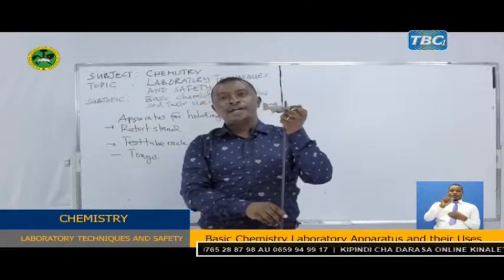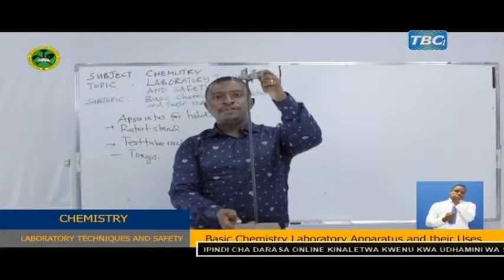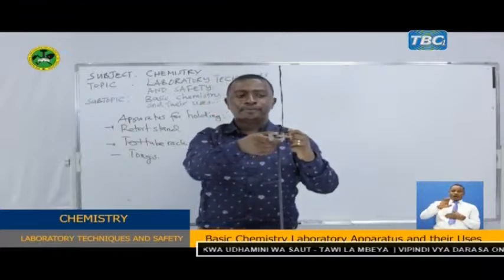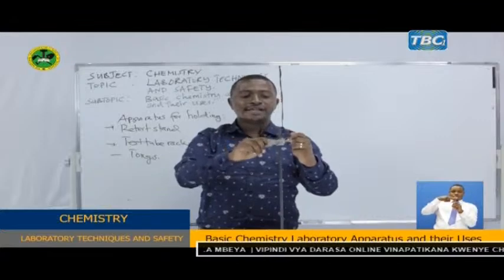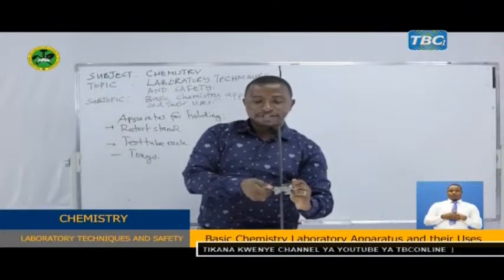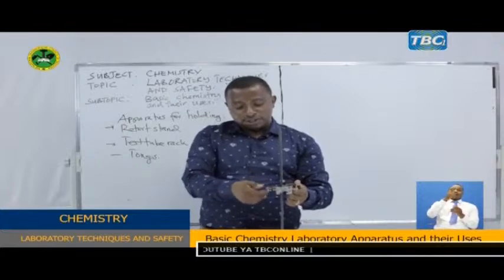This is known as a retort stand. You can see it here. This is the retort stand. It has a clamp that can be adjusted to certain desirable levels.